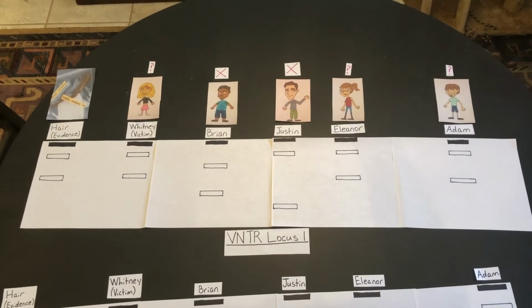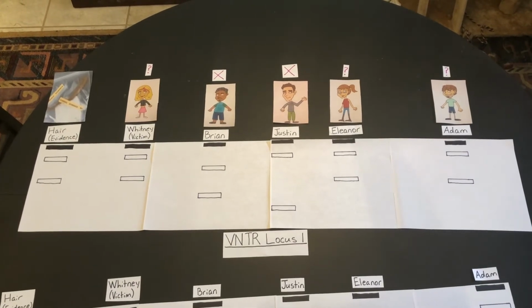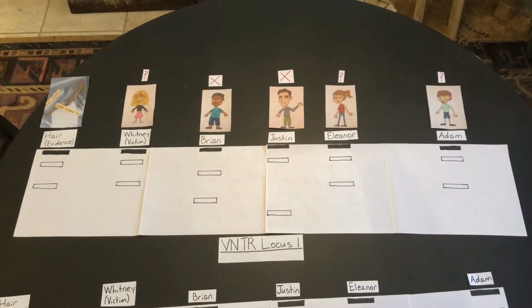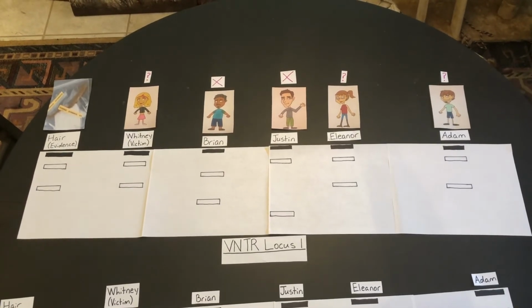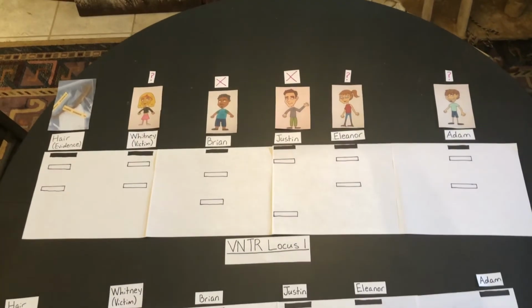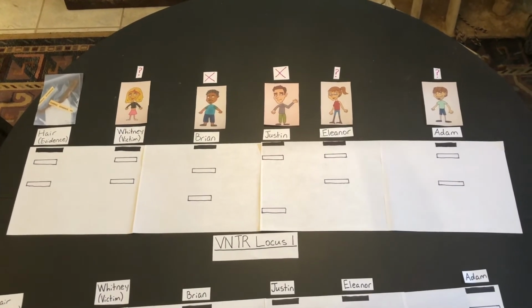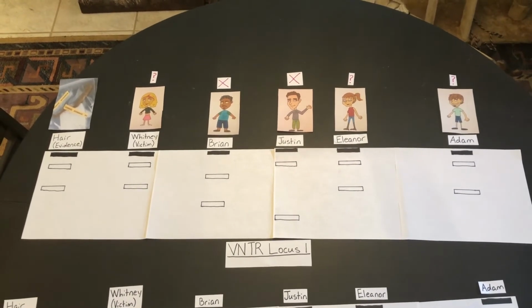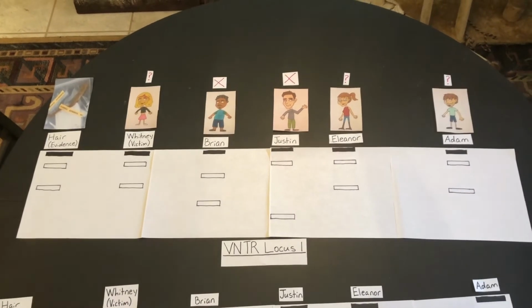For Justin, the top allele matches at the same loci with the evidence. However, the bottom allele does not match, so we can exclude Justin from leaving the DNA evidence. For Eleanor, her alleles match at the same loci with that of the evidence, so her profile is consistent with leaving the DNA evidence, and we cannot rule her out. For Adam, same thing as Eleanor and Whitney. His alleles also match at the same loci with that of the evidence, so we cannot rule him out yet.